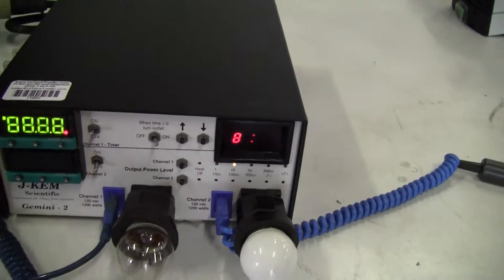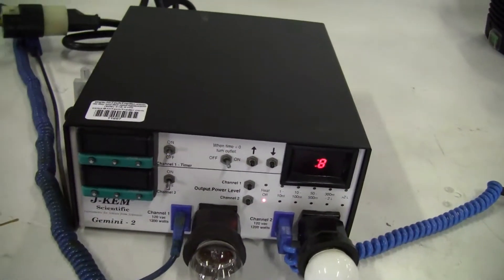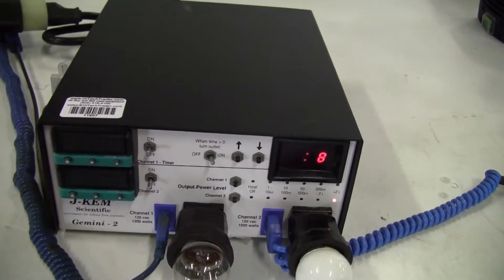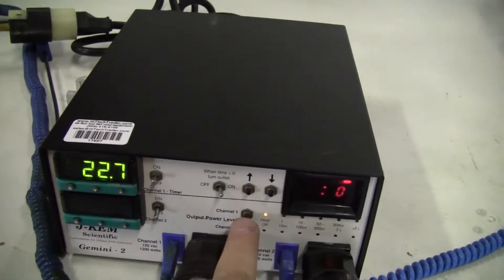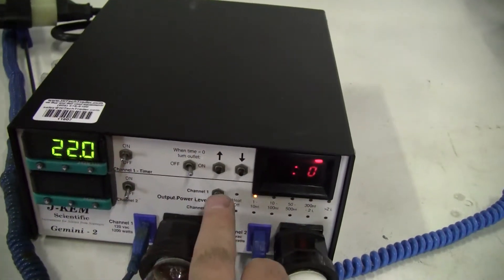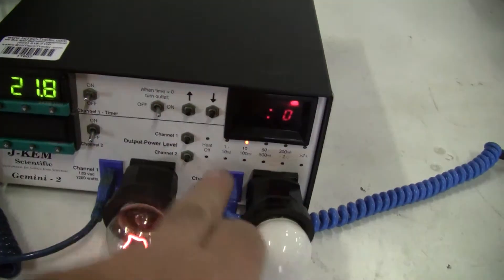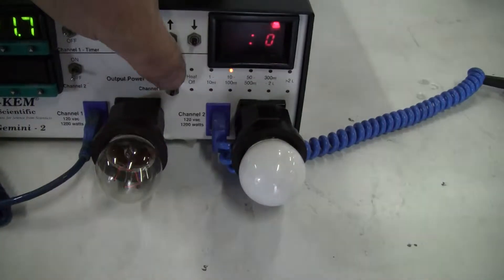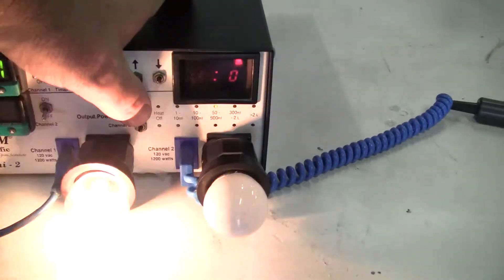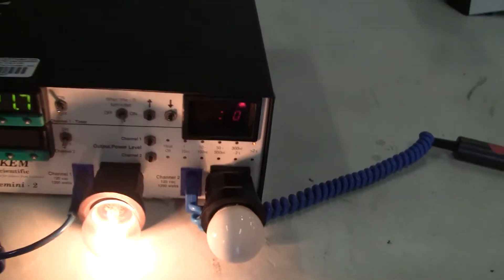Let's check out channel 1. Okay, there's our temperature. When we increase the heat, it's starting to give us some electricity juice to that. And as we go all the way up, it'll continually light.